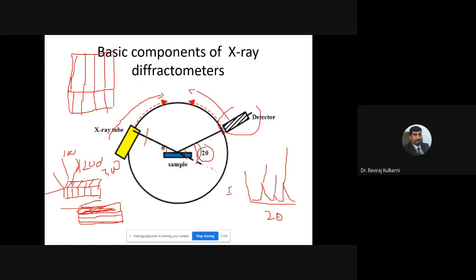Now I have cut along the z direction or y direction, and the same holds good. Now I am cutting like this, down, along the y direction.